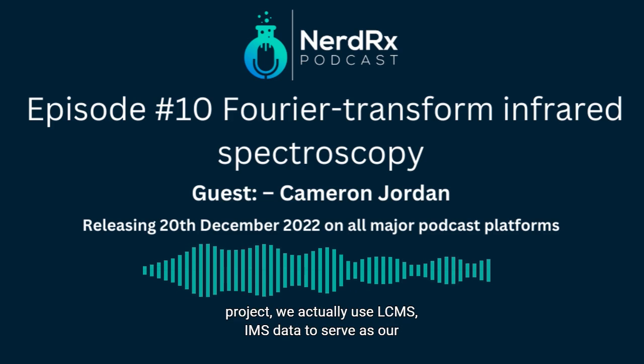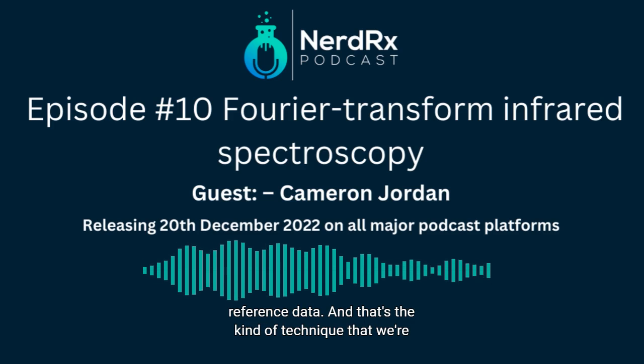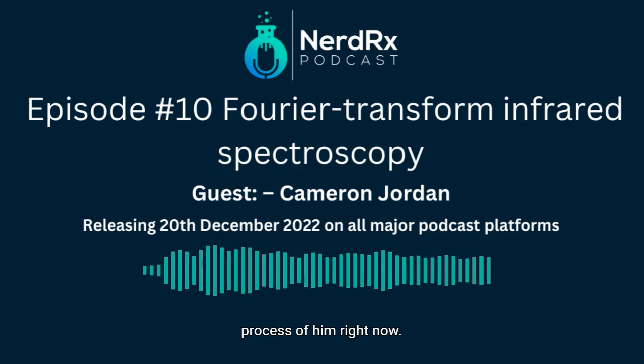For my project, we actually use LCMS-MS data to serve as our reference data, and that's the kind of technique that we're trying to replace or speed up in the analytical testing process of hemp right now.